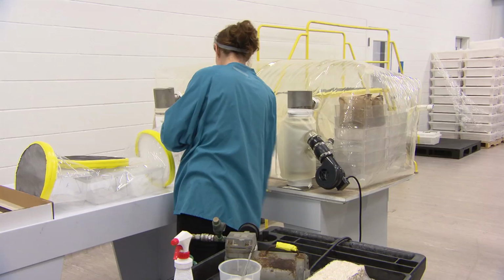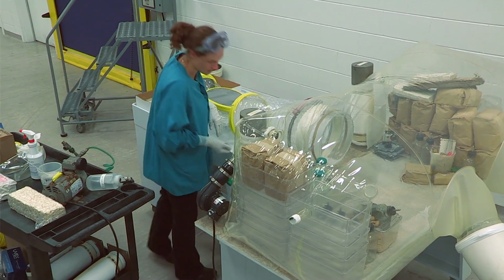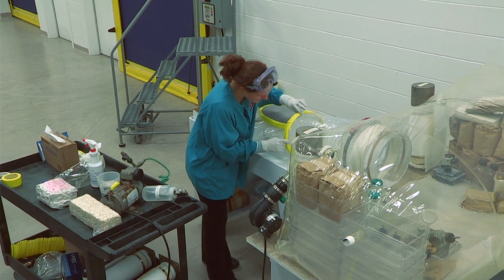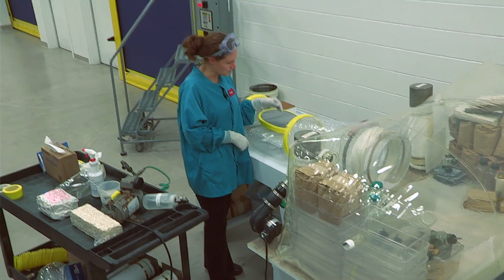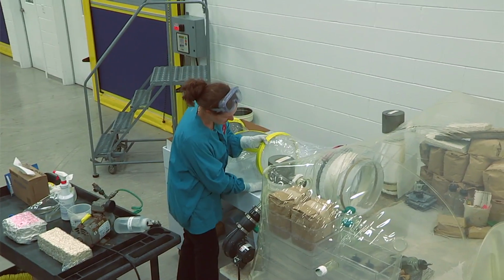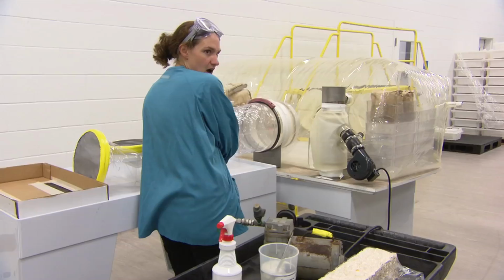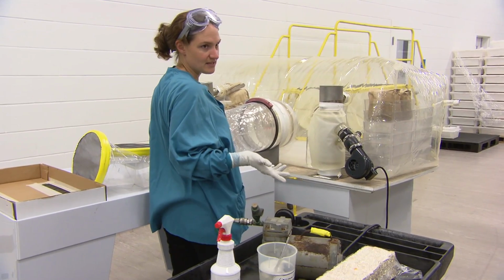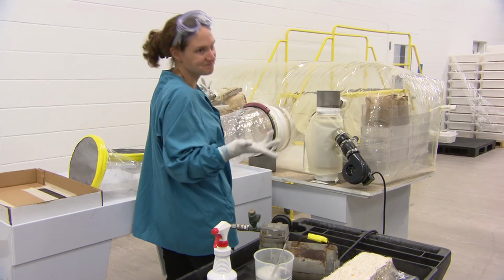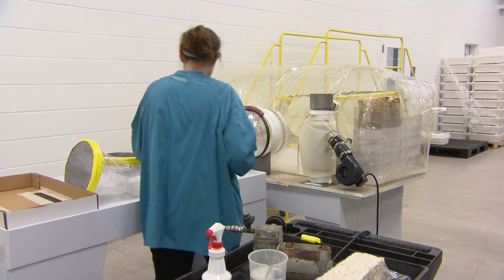So once we have this attached, again, for us, we have a sterilant contact time of 20 minutes. This ring here is cardboard, so when we're actually packing the shipper, we like to make sure that this is elevated so the sterilant isn't sitting along the cardboard ring. But most times when you're receiving, you're not going to be reusing this shipper, so if the cardboard ring gets a little wet, it really doesn't matter.